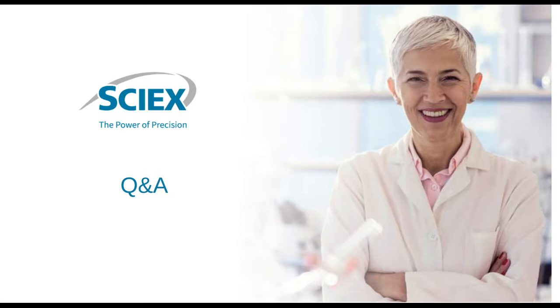Plus, because we run at so low flow rates, I think, Whitney, correct me, it's 30 to 50 nanoliter per minute or so. We see CESI typically, we don't see any kind of suppression effects from the matrix, from the background, from other analytes. So I would say yes, it's very comparable, plus very much faster.